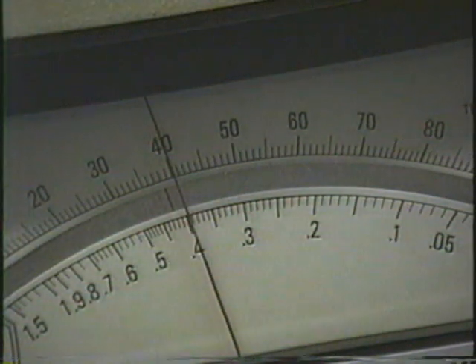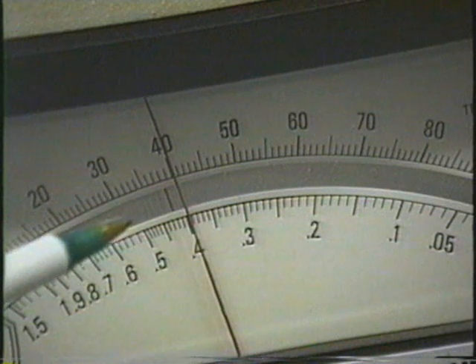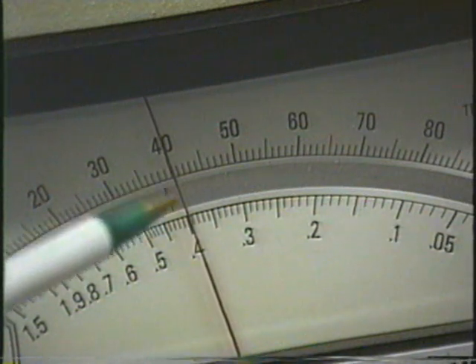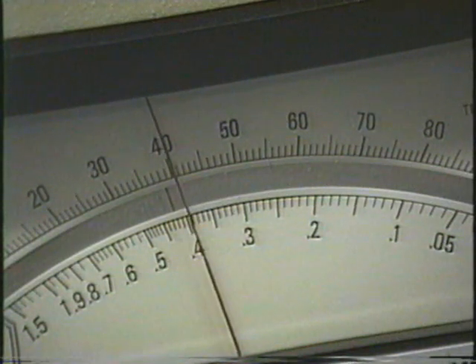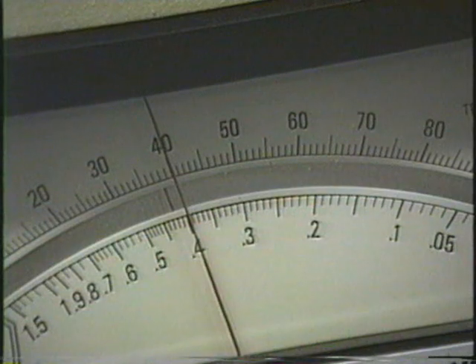Now we moved the camera so we're well off to the right, and as you can see now, there is a reflection of the needle in the mirror that you can see. And now, instead of reading 39.2, because we are looking at it off at an angle, it is actually reading something like 40.2. This is the parallax error, and this is something that you should avoid.